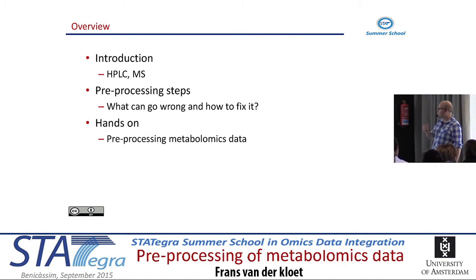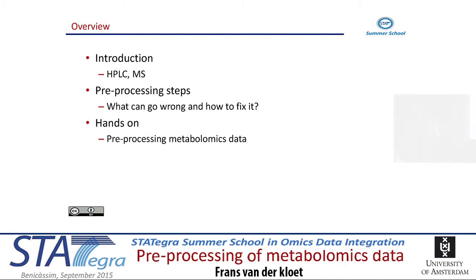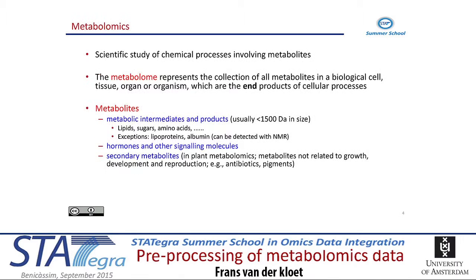with a couple of metabolites, and you can try to answer the questions that I created with them. My presentation will be followed directly by Andreas about proteomics, and it's also a logical flow, because I will be talking about mass spectrometry and the separation technique needed to identify the compounds, and of course that will be used in proteomics as well.